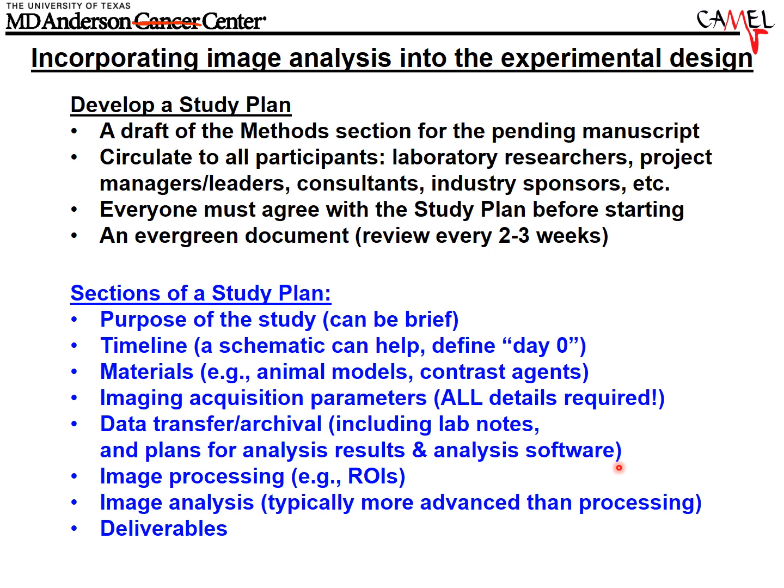I know that takes time, but if you ever want to go back to that data set and know which M file you used to produce those final results from your analysis, well, it's nice to have that M file there. Otherwise, you might be scrambling thinking, okay, which version of M file, which MATLAB processing routine was used to produce these results? And that can be really challenging. So we like to store everything we can within the data files that come from our Bruker machine.